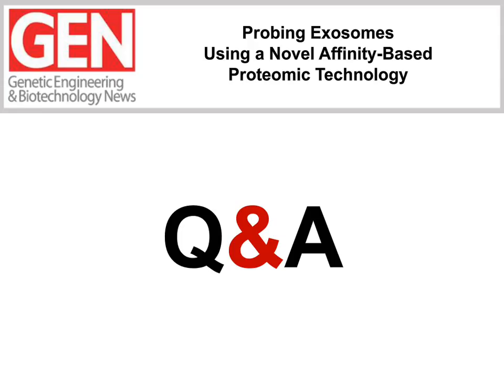And Aled, someone asks, how did Dr. Clayton immobilize exosomes on the plate? All right, that's really very easy. So we buy in plates which are designed for you to make your own ELISA-type assays. So these are sticky plates. They're designed to bind antibody. You can buy these plates from multiple manufacturers, and they have different protein binding capacity for each well. So we generally use high protein binding wells. I think they bind around 14 nanograms per well or something like that.